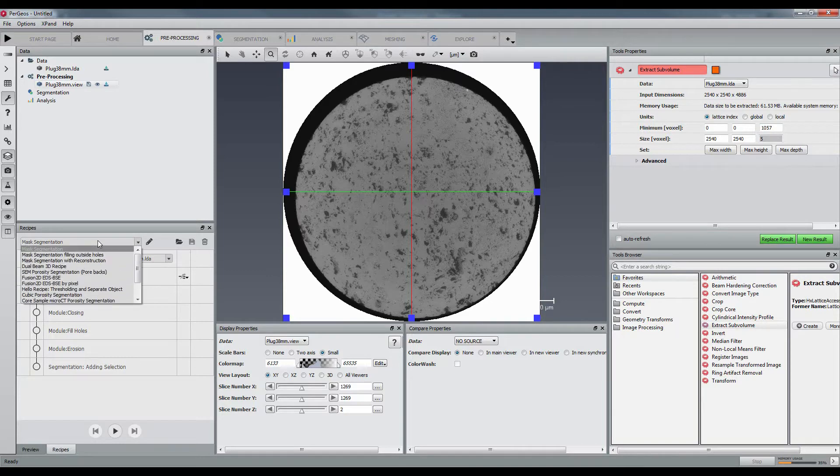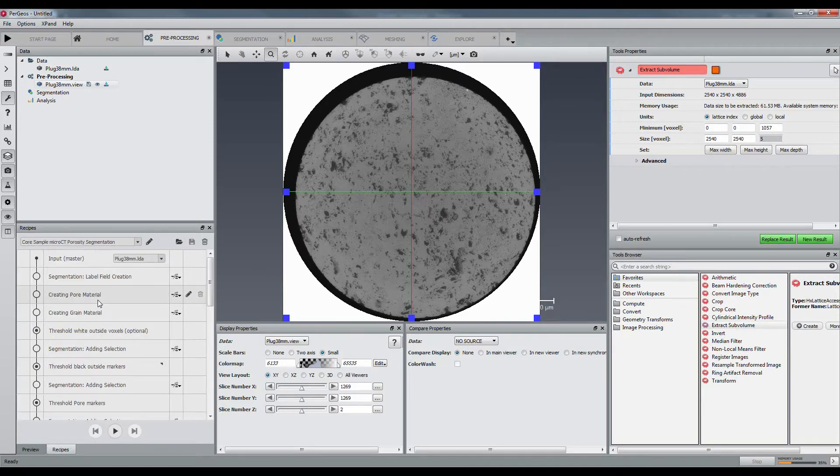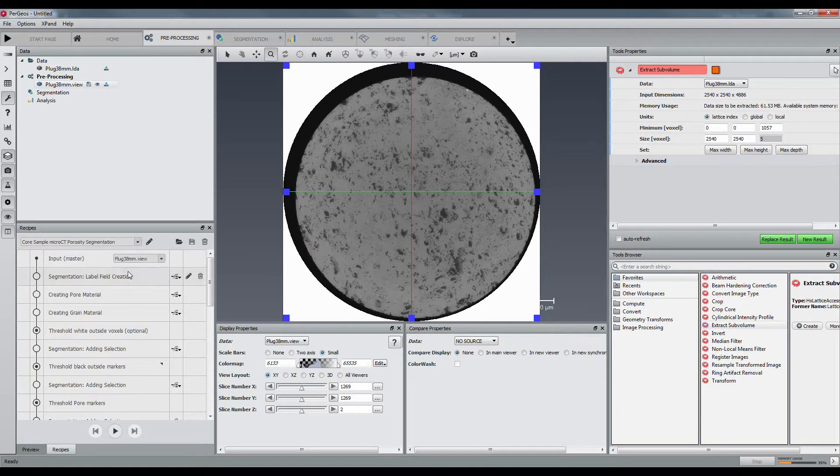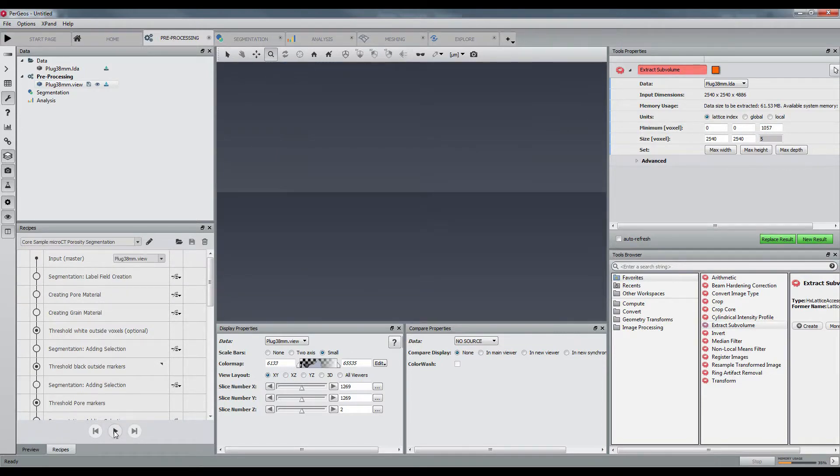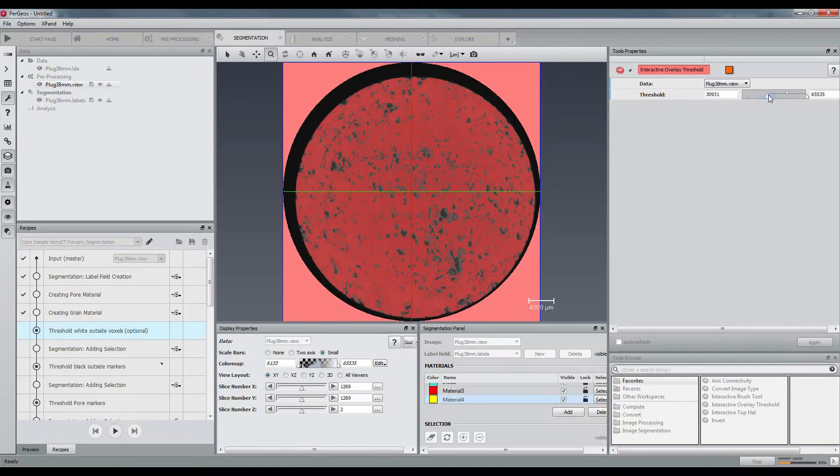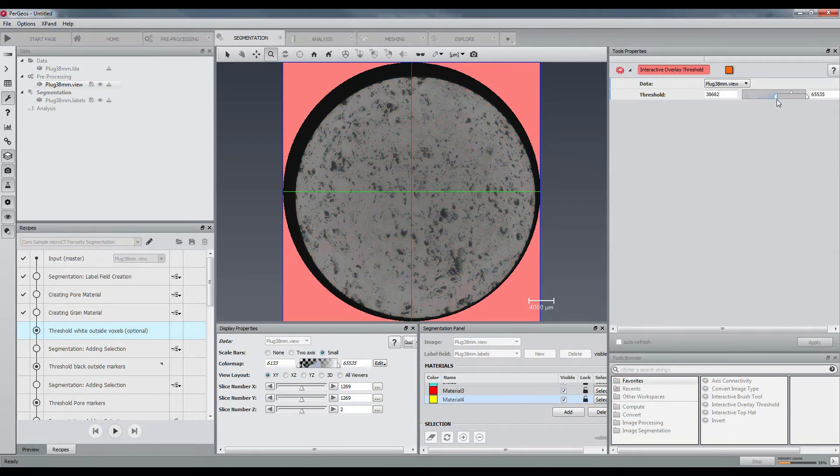Now let's apply the CoreSample MicroCity Porosity Segmentation recipe. The first breakpoint will be used to threshold the white voxels around the core, then the black ring around.